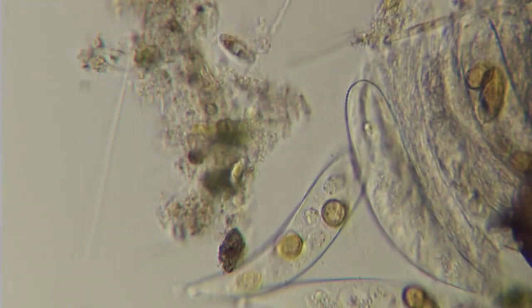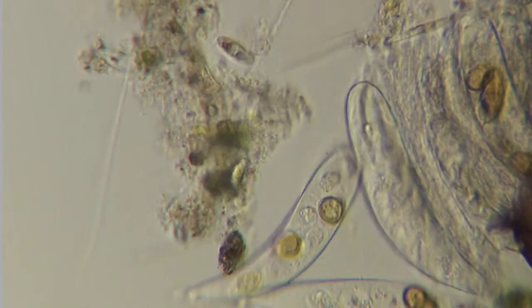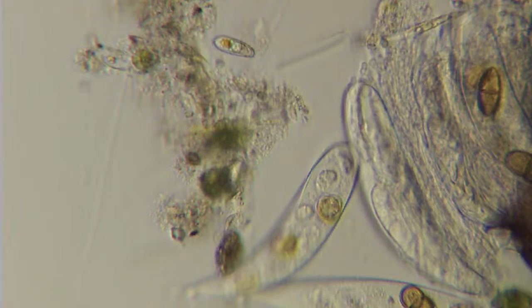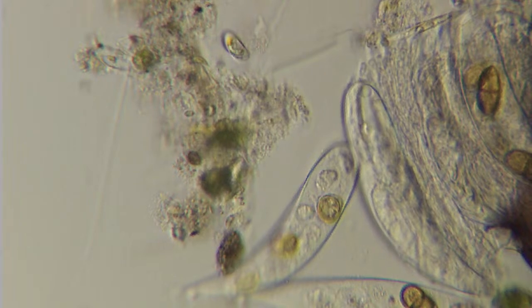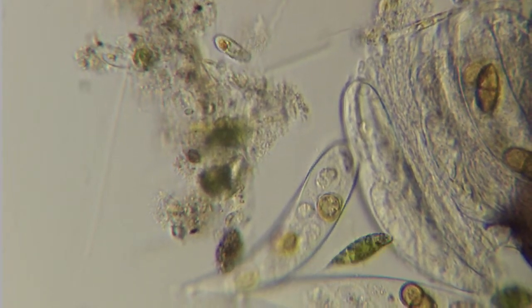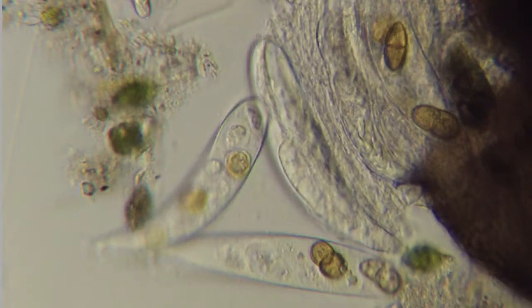There's another ciliate of some kind. Much smaller than a paramecium, but it has a similar shape to it. But it's a flagellate. See the little flagellum there? And these guys are very interesting, all clustered together like this.